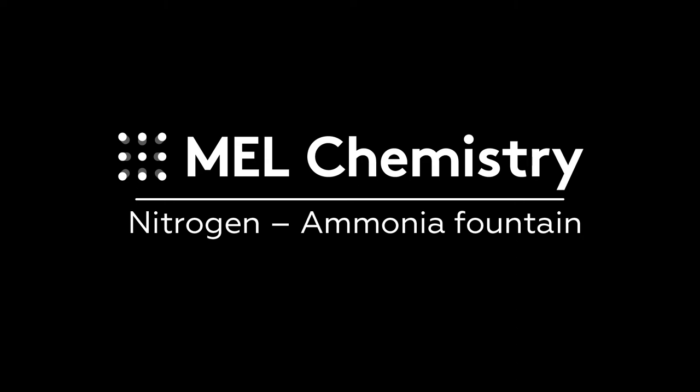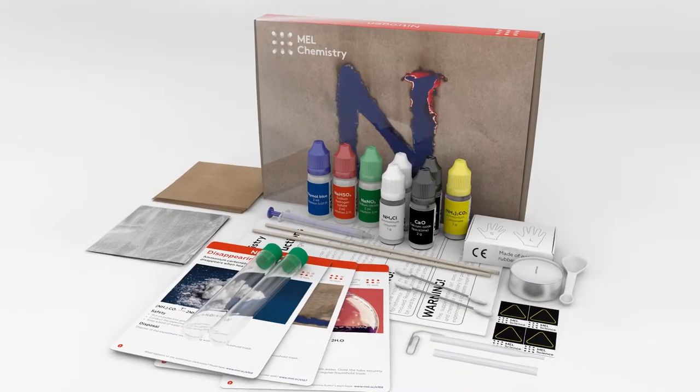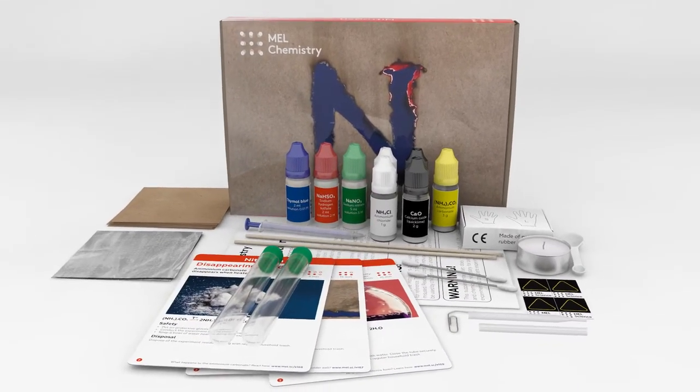Welcome to the wonderful world of chemistry. Today, with the help of the nitrogen set by Mel Chemistry, we will make an ammonia fountain in a flask.